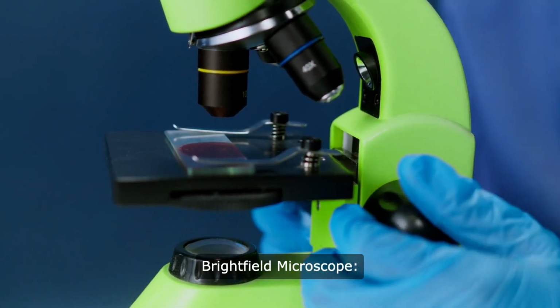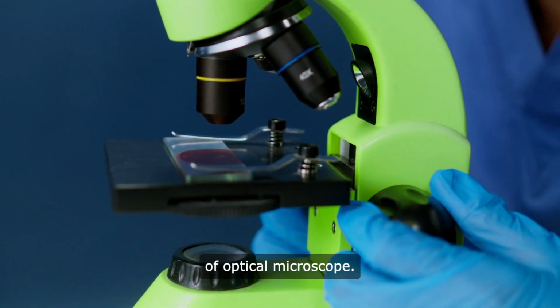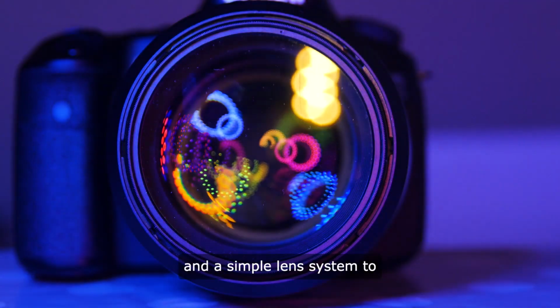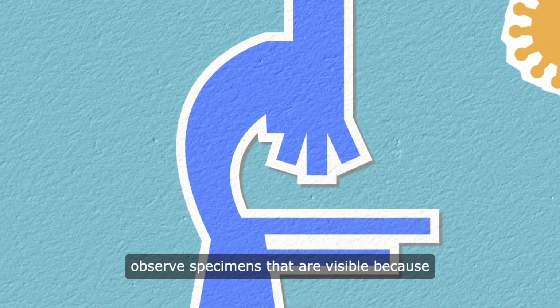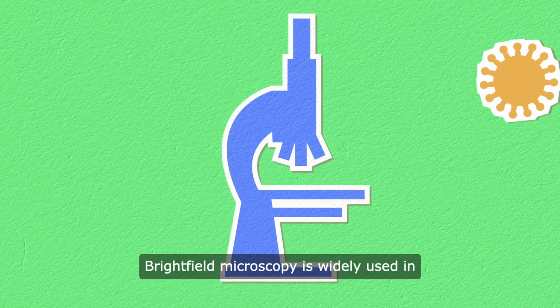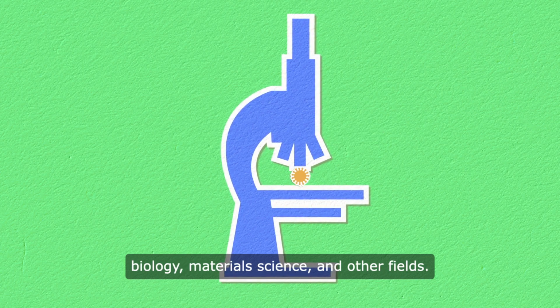Bright field microscope. This is the most basic type of optical microscope. It uses a bright light source and a simple lens system to observe specimens that are visible because of differences in contrast and shading. Bright field microscopy is widely used in biology, materials science, and other fields.